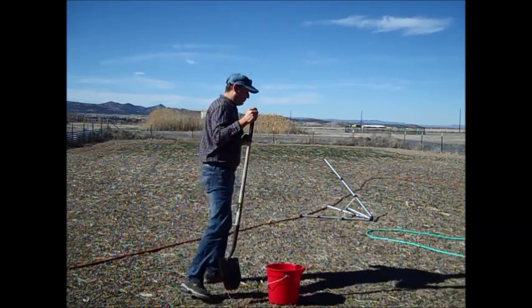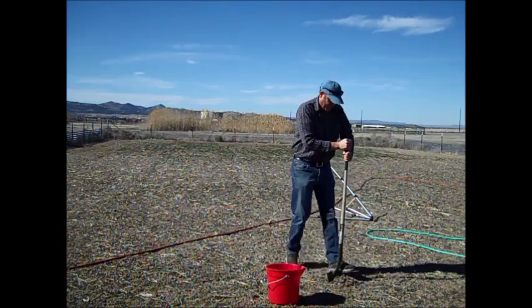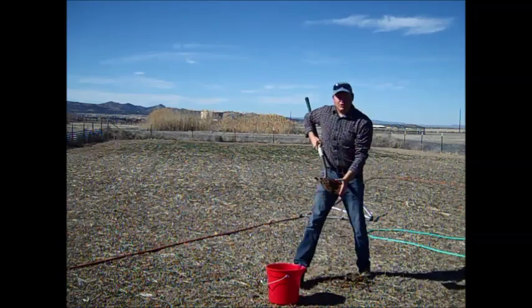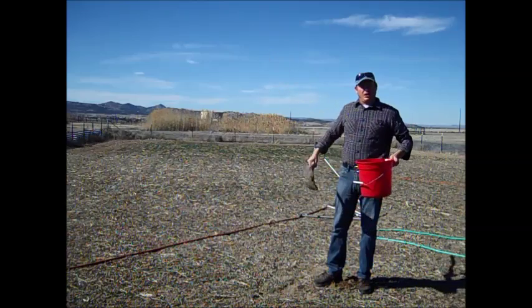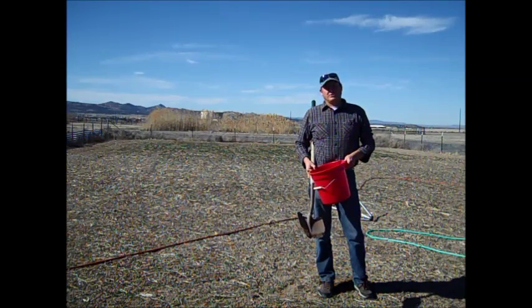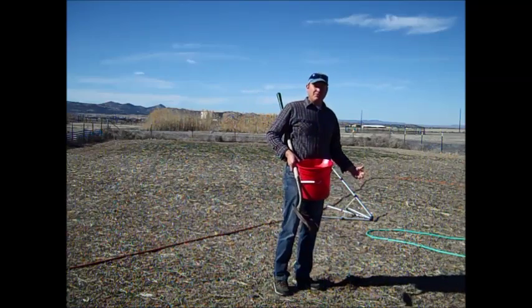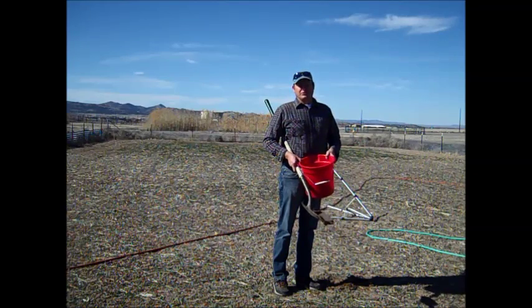You want to take your sample about 6 inches down. This is nice friable soil, 6 inches down, and you want a good example of that soil down throughout. Now I've collected 3 of those scoops. For the case of our soils class, a gallon sandwich bag would probably be enough. A gallon of material is more than enough soil that you need. So I took down to 6 inches in depth, and I did this multiple times. I got my soil. Now let's go to a nice place where I can analyze the soil.